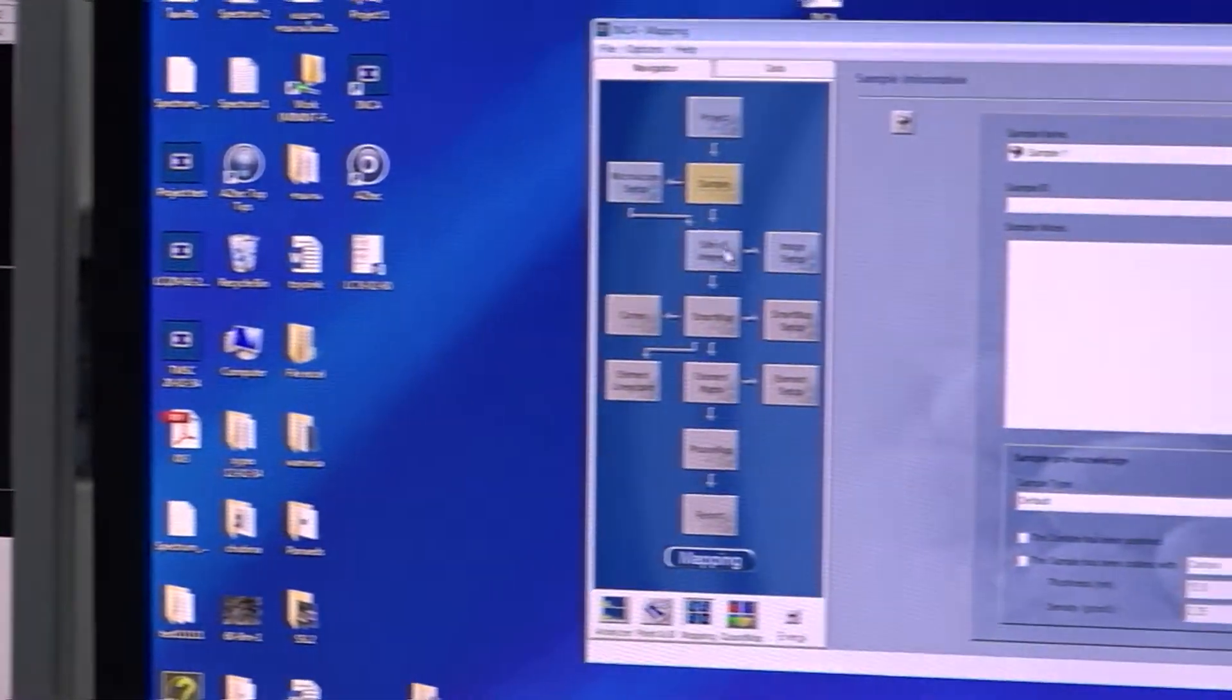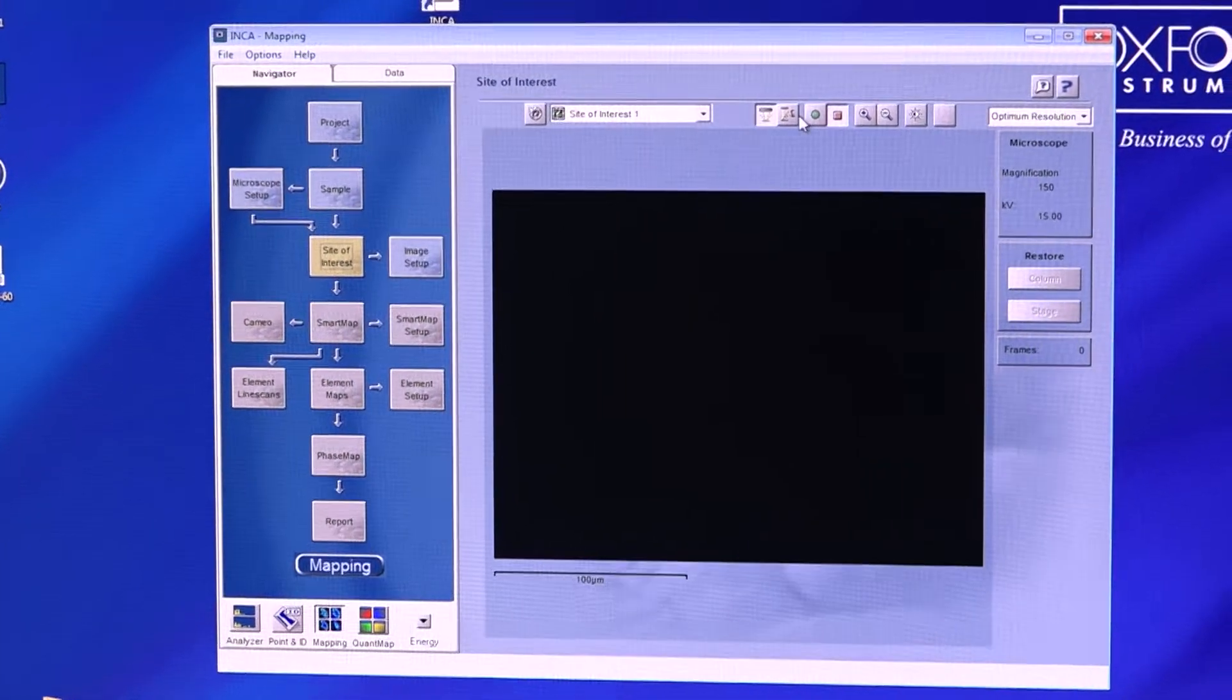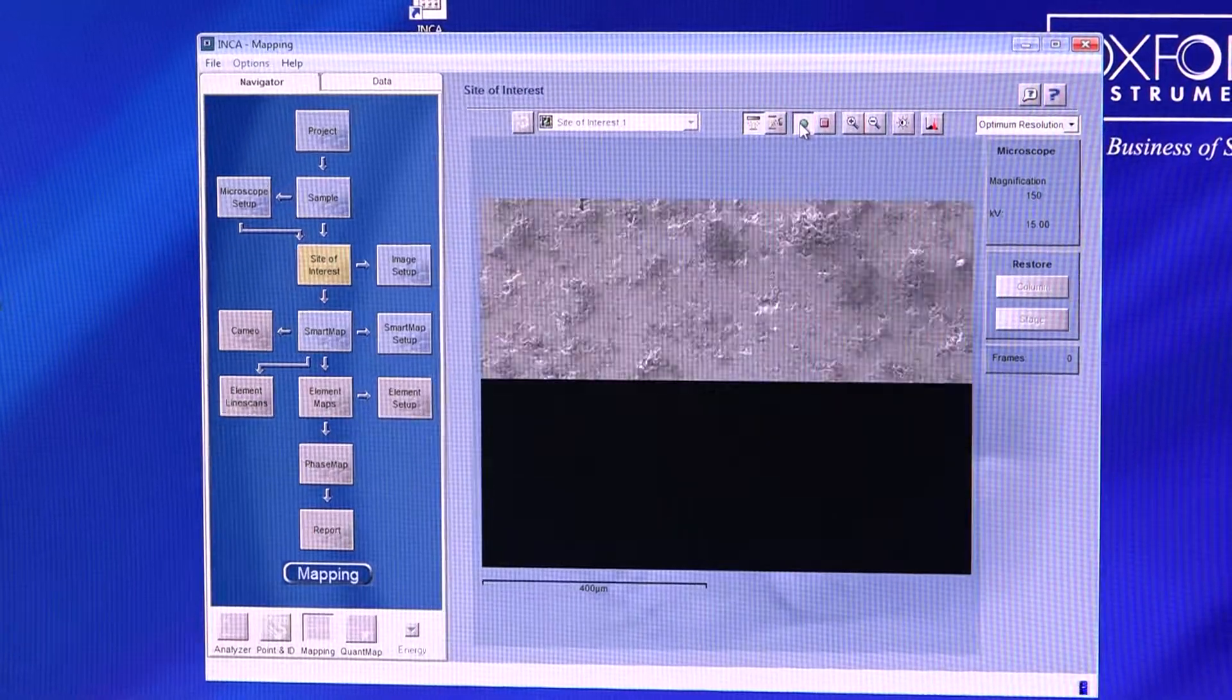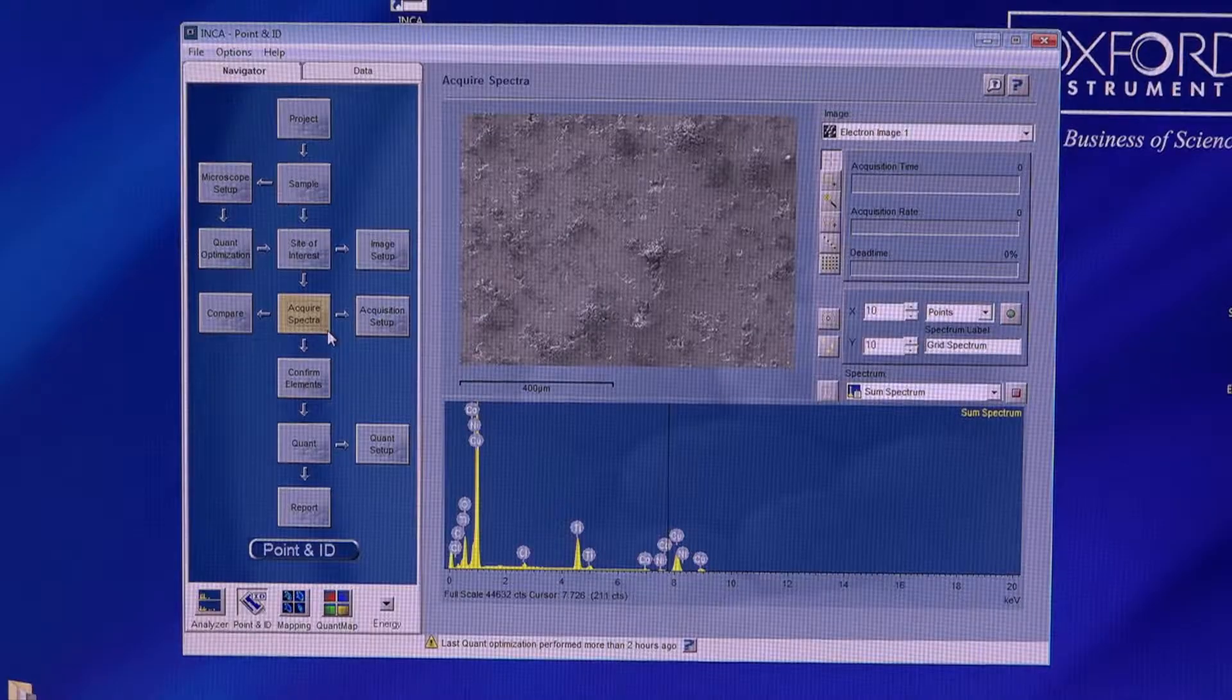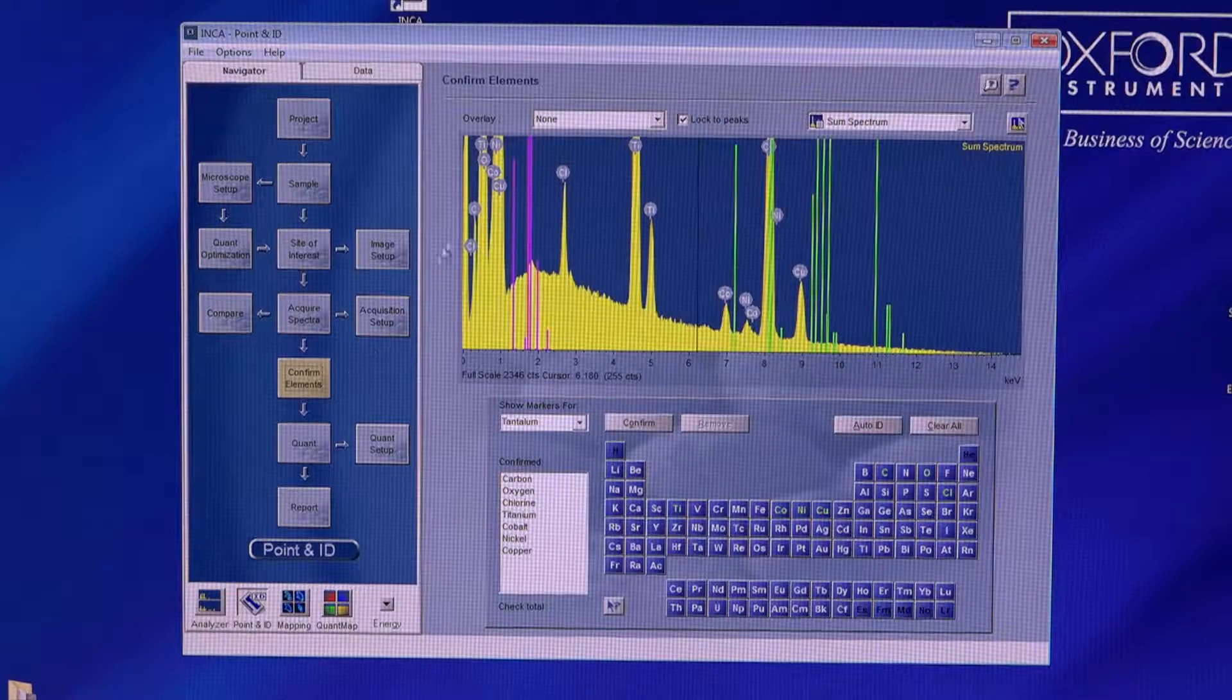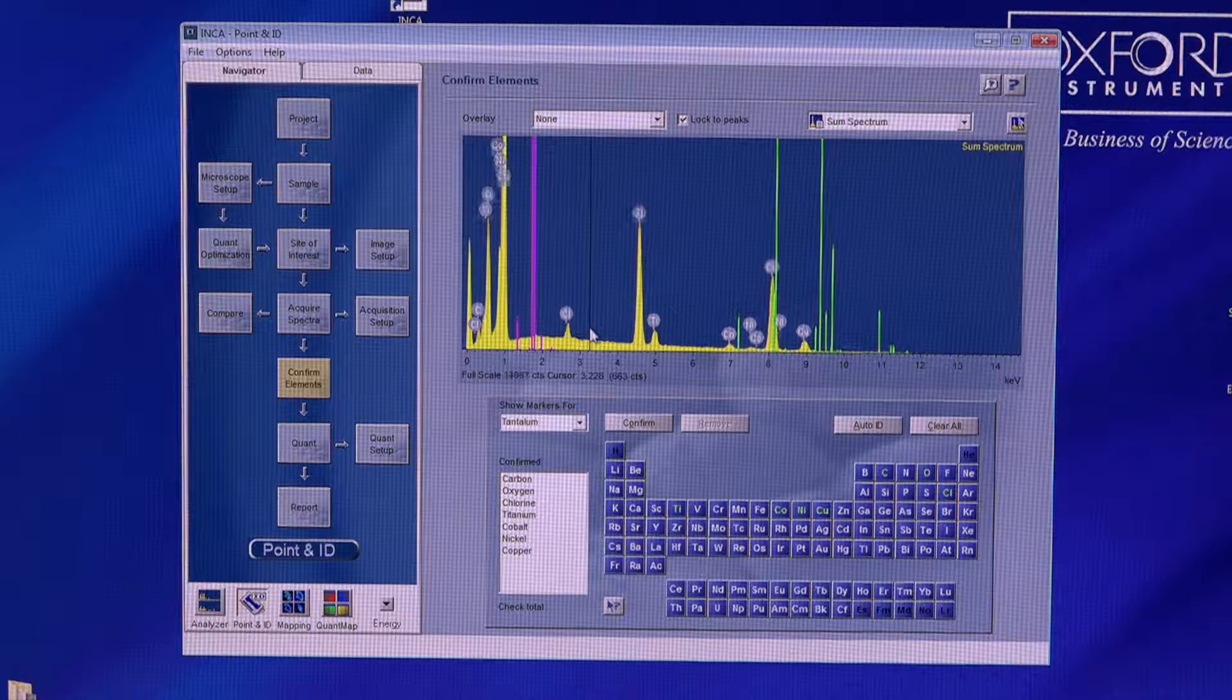The SEM model JSM6610LV is equipped with low-vacuum mode, enabling observation of samples without metal coating.